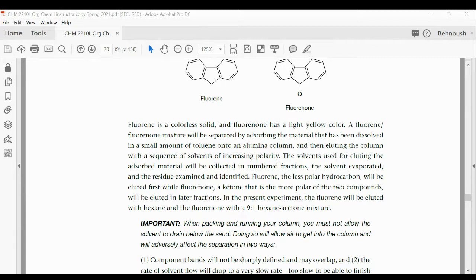Traveled for solvent, and then the distance traveled by each of the samples, or the distance traveled for anything that shows up on TLC. So you need one for solvent and one for each spot. Very good. When you have those numbers, that goes into the table. If you want to include the Rf values, that's okay, that's perfect. But what is needed is those four items: the distance traveled by solvent and other samples. And then underneath, you would show your calculation, how to calculate the Rf values.